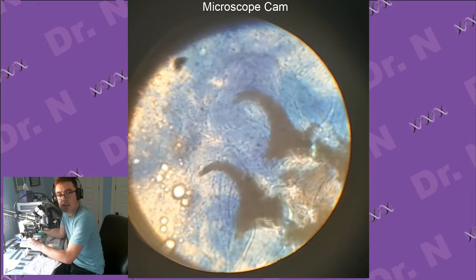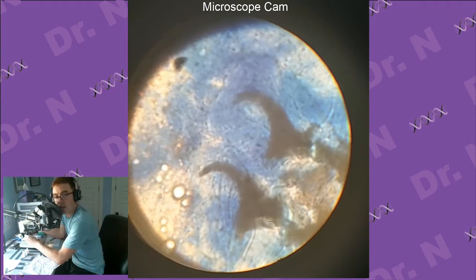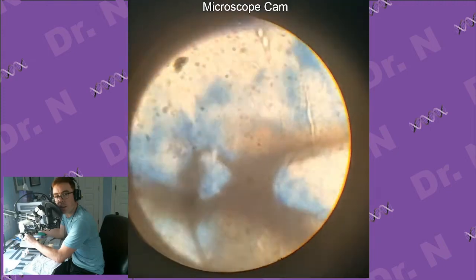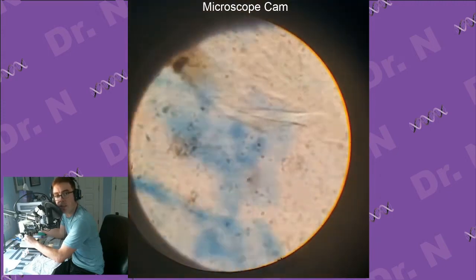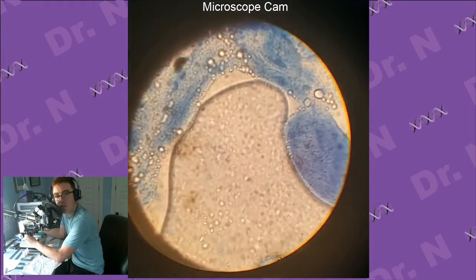So they kind of go around scooping up, breaking up food. And the rest of the mouth hook is just kind of elsewhere in their body. So this part is like inside them, attached to muscle. Yeah, that's cool, but not actually what I'm looking for.